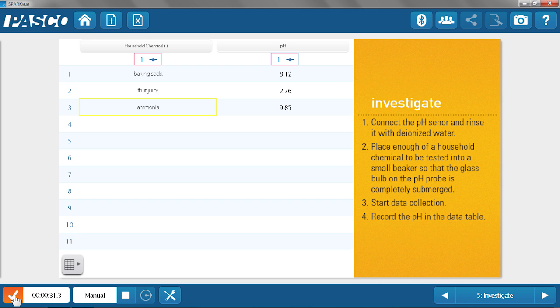And it's ready to go in the last ammonia solution. And there we go. We see a nice big jump for that pH. And I'm going to hit check for that one. And then I'm going to stop my data collection.